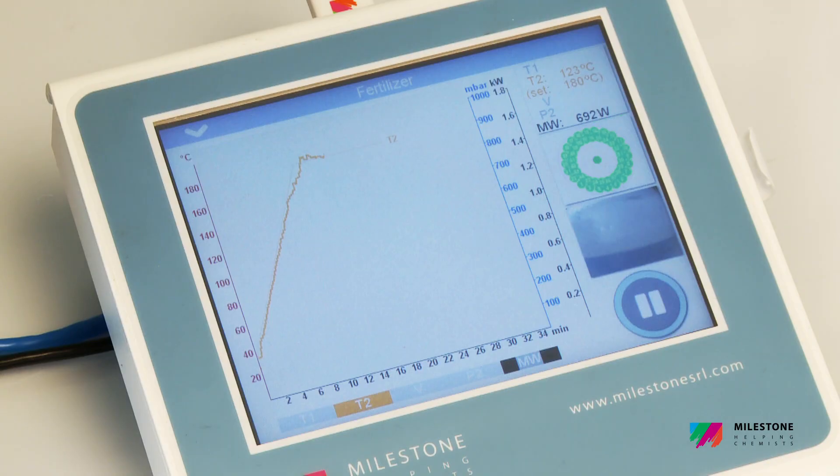The temperature diagram and profiles are displayed in real time and then saved on the Ethos UP terminal.